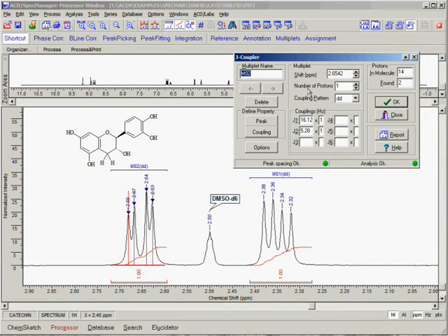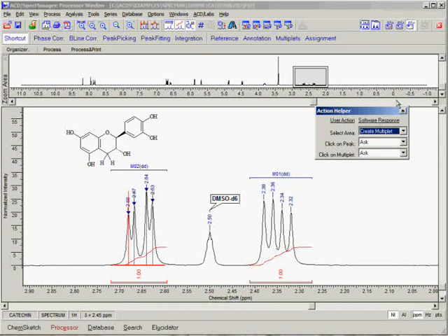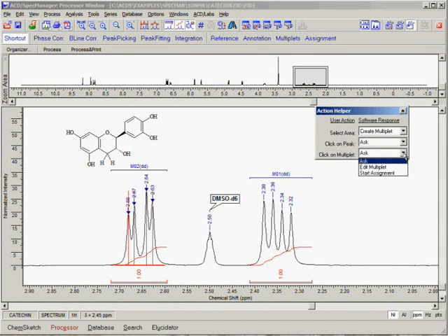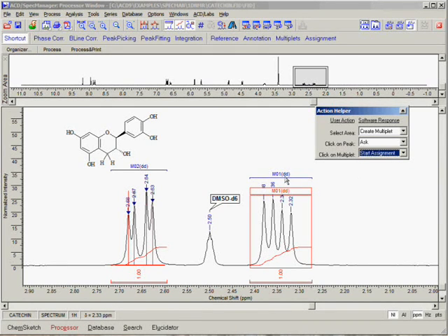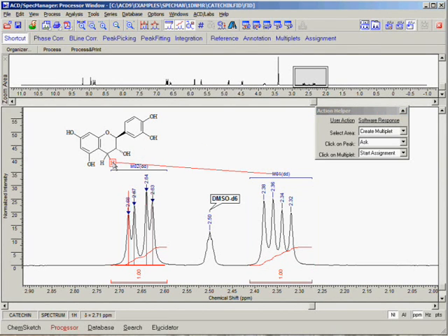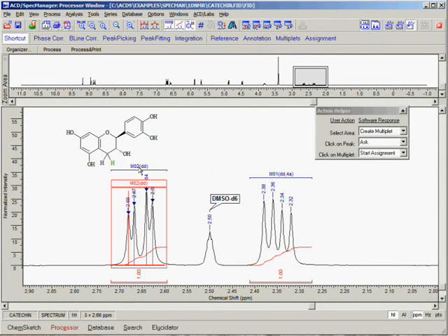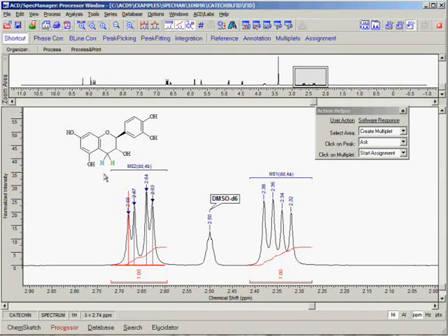We encourage you to customize the Action Helper options to optimize your own spectrum preparation workflow. Finally, we can easily assign multiplets to the atoms in our structure. Before we begin, we want to go to the Action Helper and choose the option Start Assignment for whenever we click on a multiplet. Now we can easily assign the multiplets to the atoms on a structure by left-clicking on the peak of interest and dragging the mouse pointer to the corresponding atom in the structure. Notice that after an assignment is complete, the atom changes color to indicate that it has been assigned.